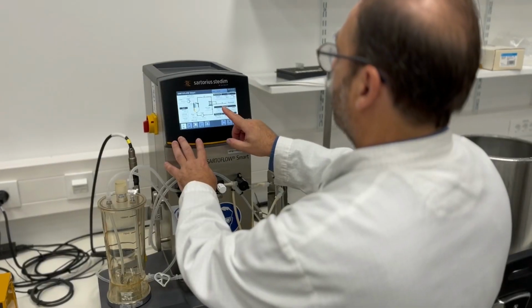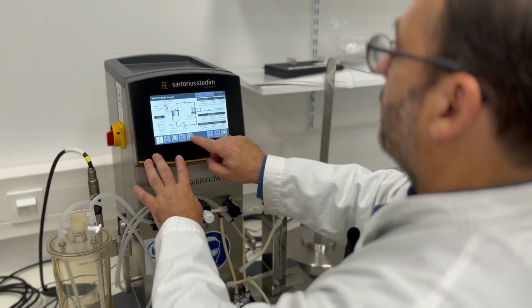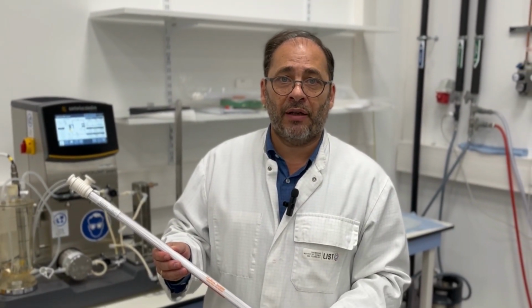Once the products have been isolated in a soluble manner in a liquid phase, we sometimes need either to concentrate them or to fractionate the crude mixture in order to gain a level of purity and concentration. This can be done utilizing, for example, tangential flow filtration, utilizing hollow fibers in this case, or sometimes flat sheet cartridges as well.